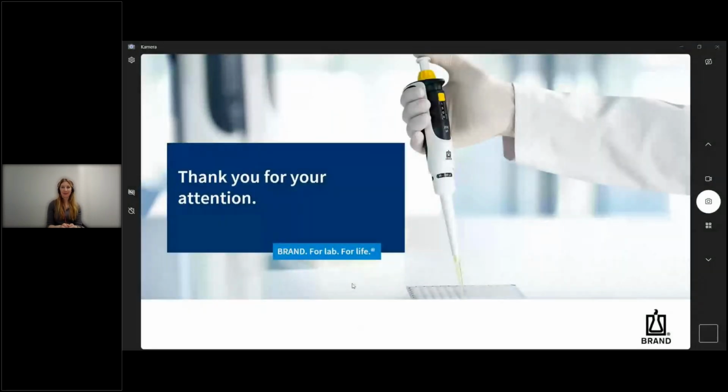Are there more questions? Yes, there is one more question. Must the pipette be calibrated after disassembling?